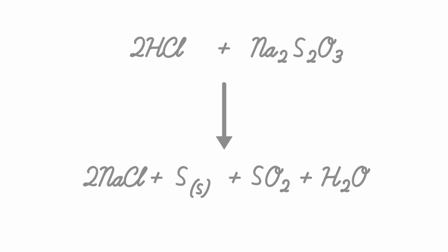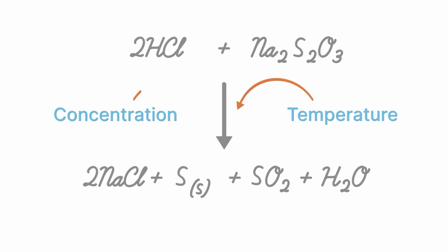This experiment has two components to it. One where we change the concentration of the reactants to affect the rate of reaction, and the second where we change the temperature to affect the rate. Both experiments use the same experimental setup for the most part, so we will examine the common method they share first before looking at the two individually.